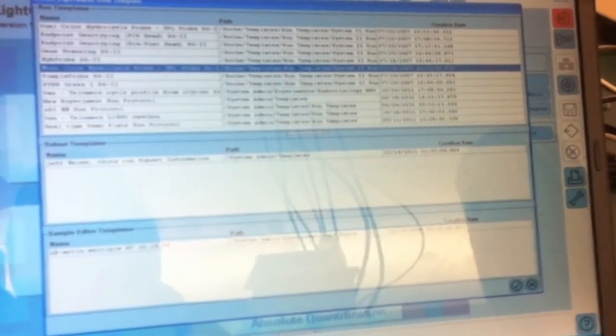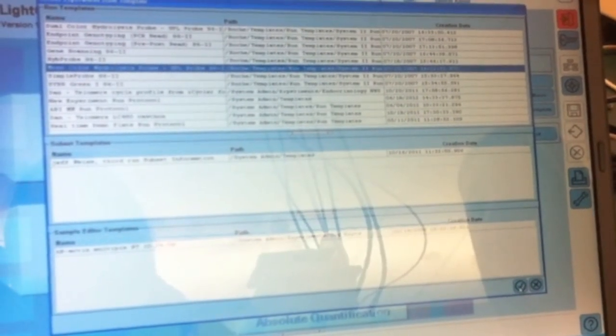Then, we'll select a new experiment from the template. We'll scroll down to our specific running protocol. In this case, we want monocolor hydrolysis probe. We'll click on the check box.